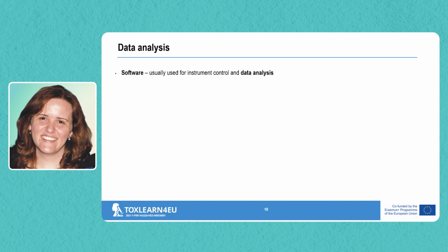And then we need to consider software. So this is quite important. Actually, many people choose their flow cytometer based on the features of the software, because it is really important to have a good software for your flow cytometer.